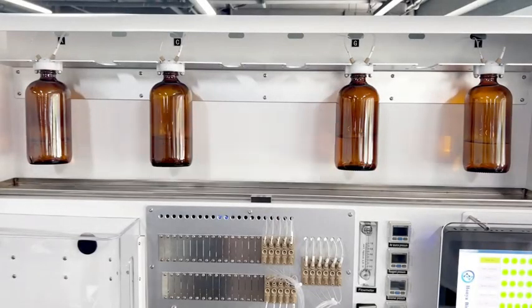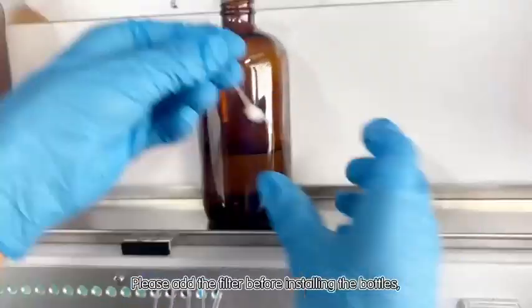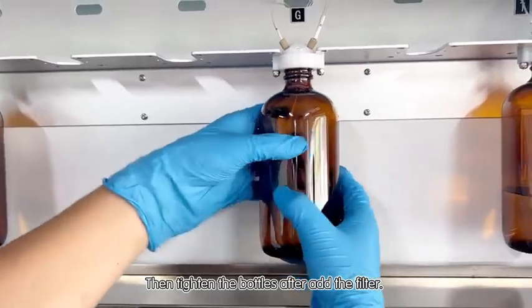Amidite bottle installation, step one. There are four sets of amidite bottles. Please add the filter before installing the bottles, then tighten the bottles after adding the filter.